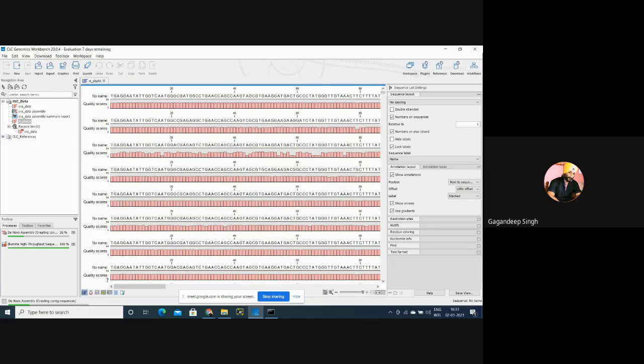Say T, T, T first, then G, then A, G, G, A, A, T. Everything is fine. But in this case, G, G, this is also fine, G, T, C, A, A, T. You can check here. This is G, G, G, and again G, C, A.